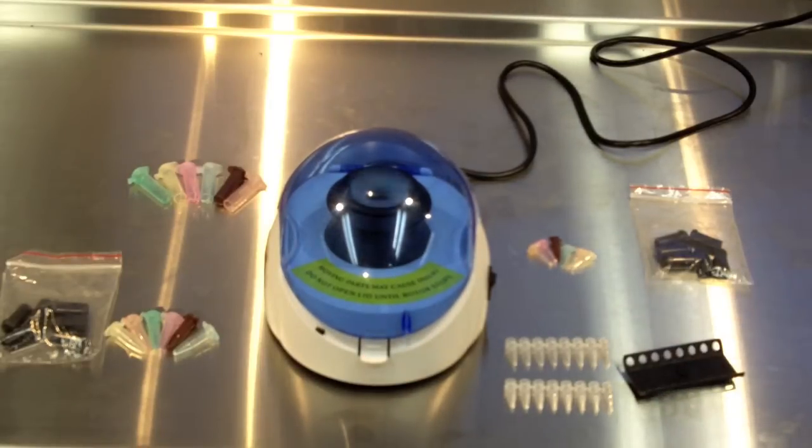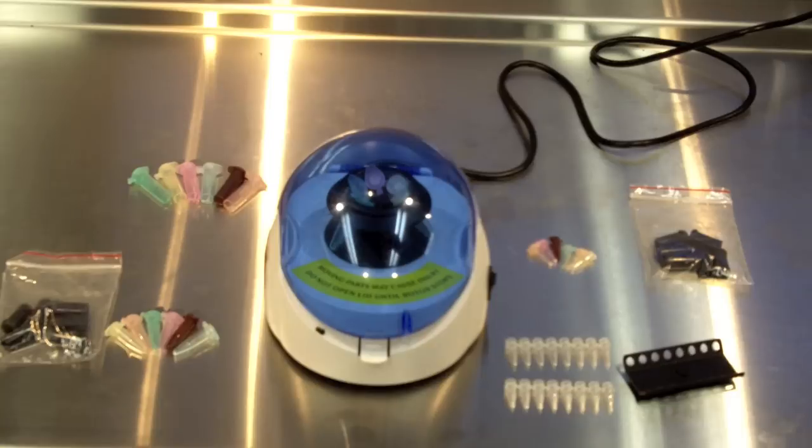The unit spins at 6,000 RPMs. If you have any questions, feel free to contact us at sales at QI-US.com. Thank you very much.